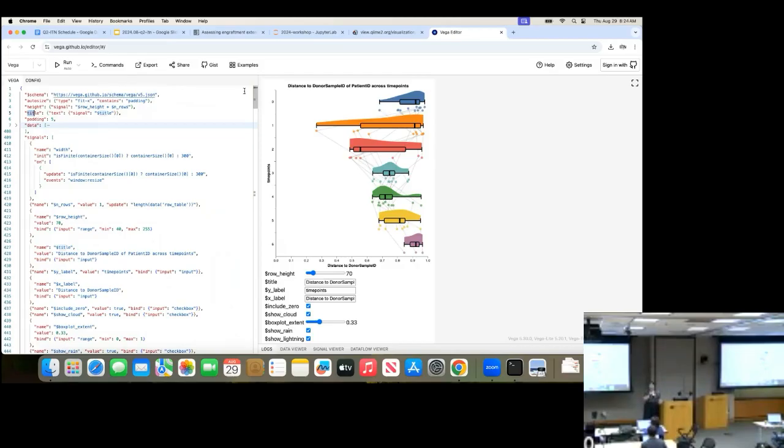So we're using an amalgamation of Python and Vega specs to get our data in a correct format and spec it into this Vega spec. And that allows us to really use the power of Vega in this interactive figure, and in addition, be able to use it for any type of data we want and not just make a singular Vega spec that can only be used once.